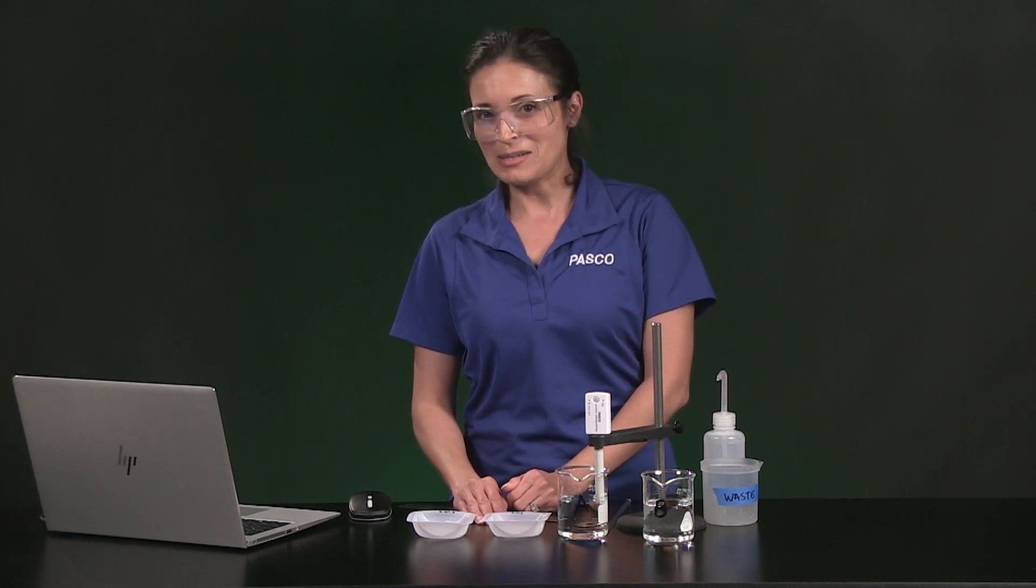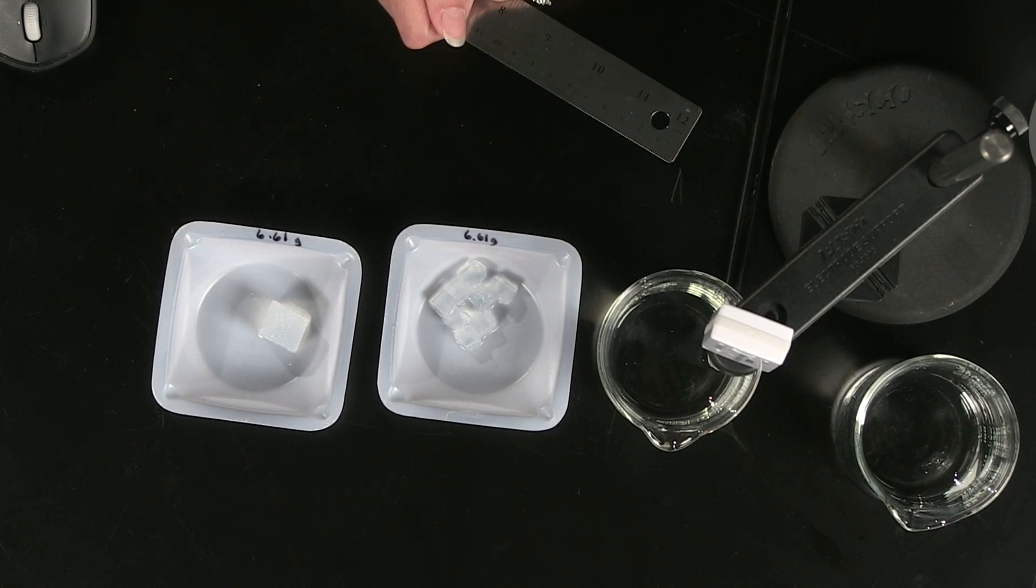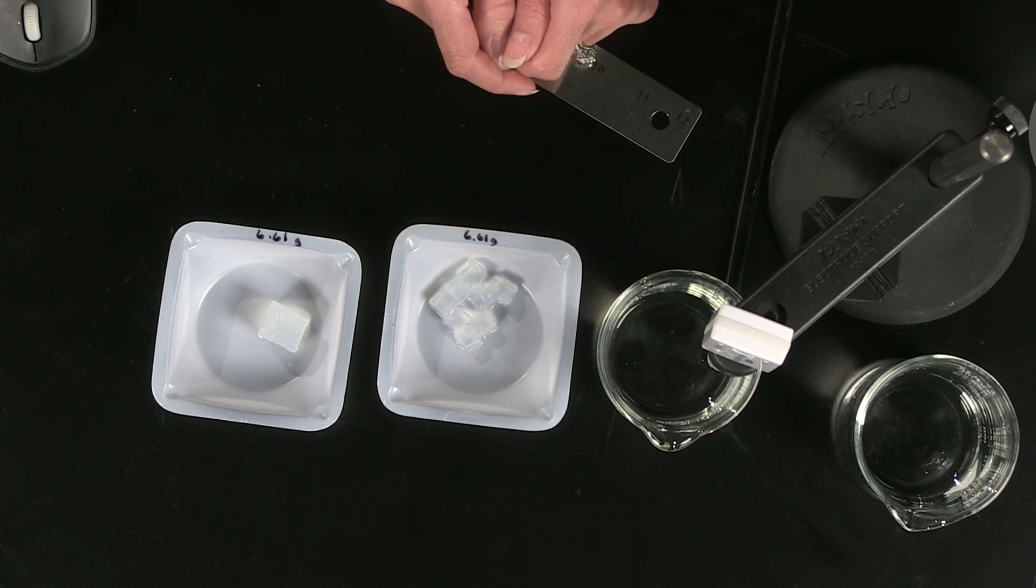You will need to record the following masses in Table 1. Sample A has a mass of 6.61 grams, and all of these pieces that make up Sample B together total 6.61 grams, so we are working with equal masses.